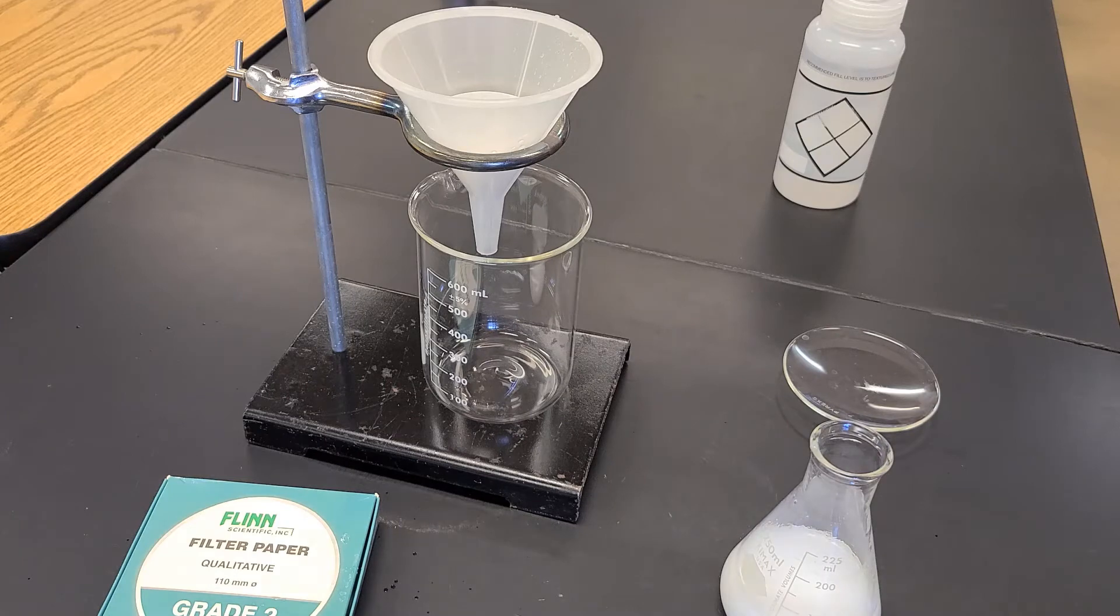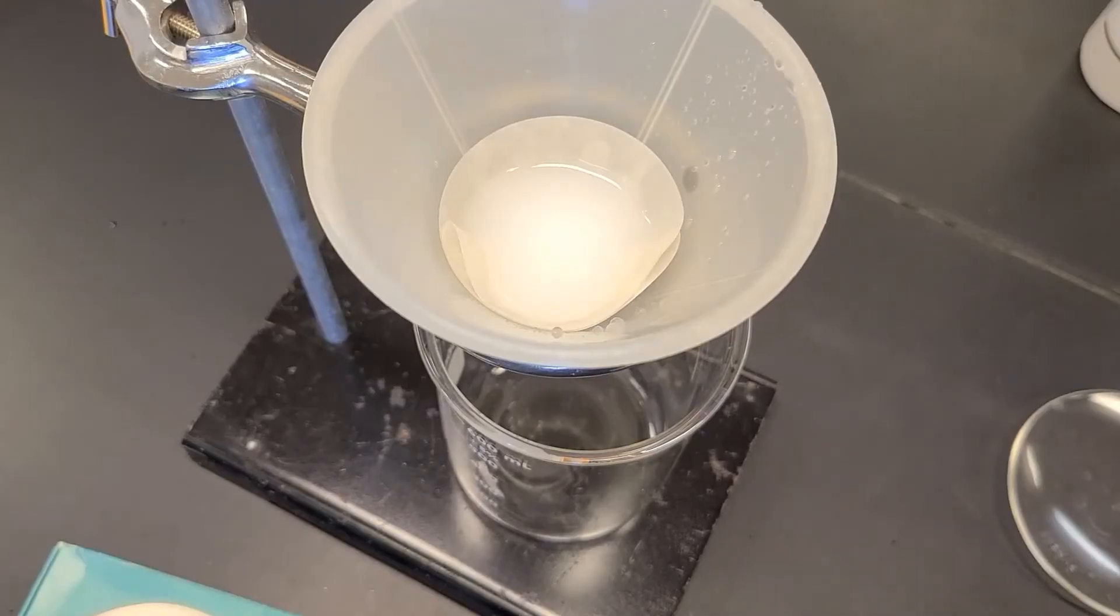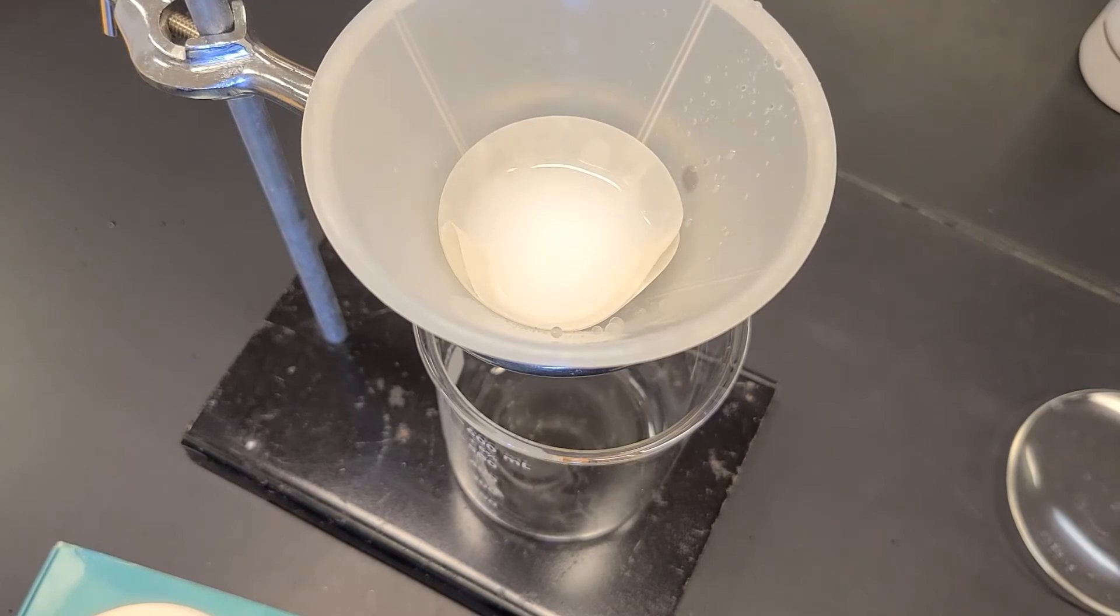You want to be careful not to add too much and you don't want to go past the top of the filter paper in the funnel because then there's gaps where some of that solid could potentially filter down into my waste beaker. You can see here what I mean by that gap being there.